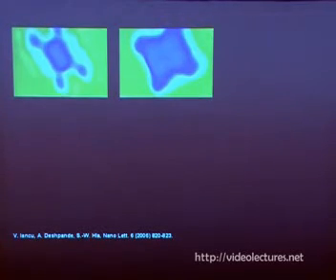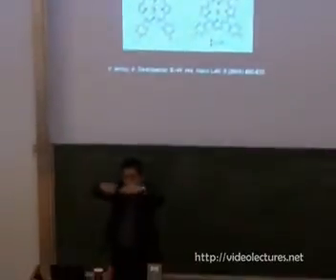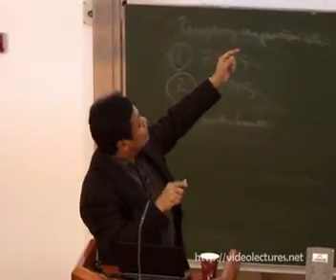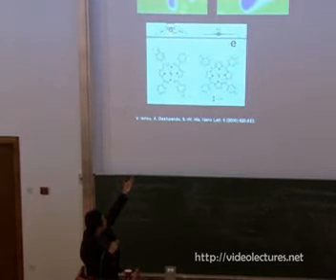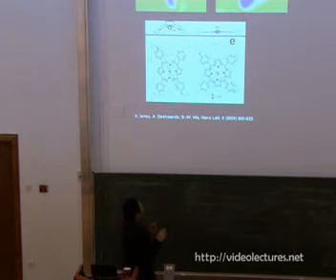When we deposit these molecules on a copper 111 substrate, we see this kind of structure. Two shapes. One is like four lobes appearing. I show it with the drawing here. Another one is two lobes. It's this drawing here. So this molecule can stay in two different conformations, flat or bent. If you bend it, you see a small, two lobes appear like this. This one shows a cross section. This line, consider this as the substrate. You have the flat molecule, where the cobalt atom is in contact with the substrate. In the bent molecule, it's narrower because the distance is now reduced, but the cobalt is lifted away, so that we now have a system with two conformations.